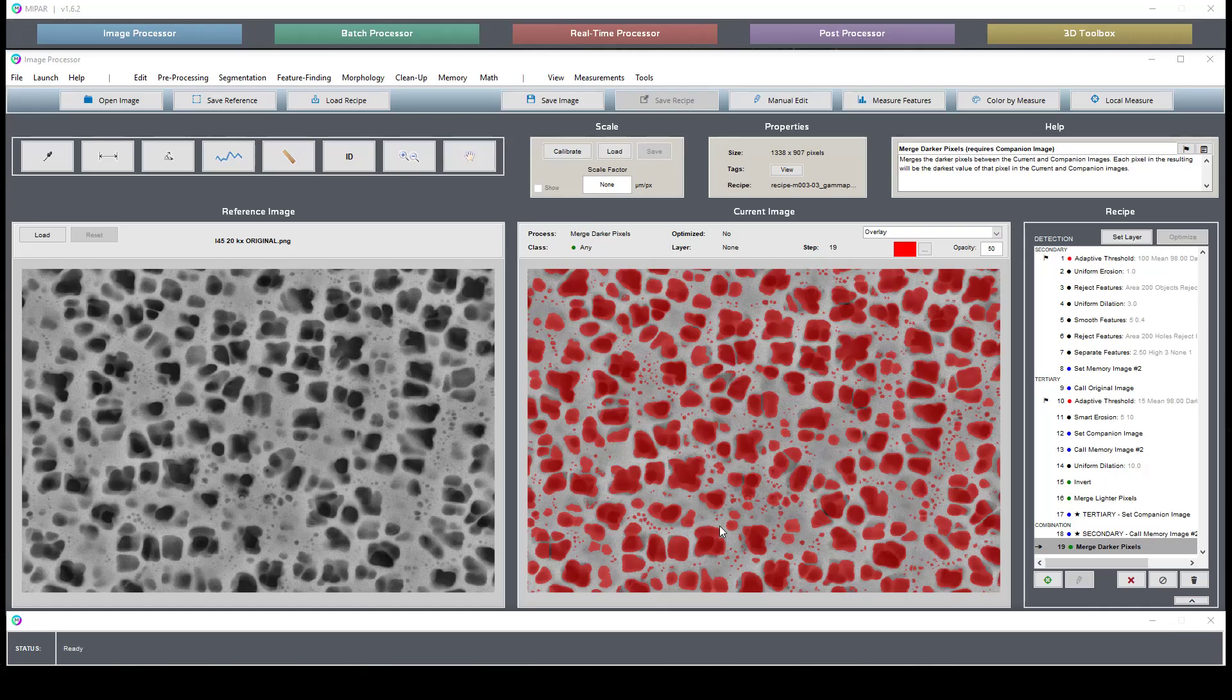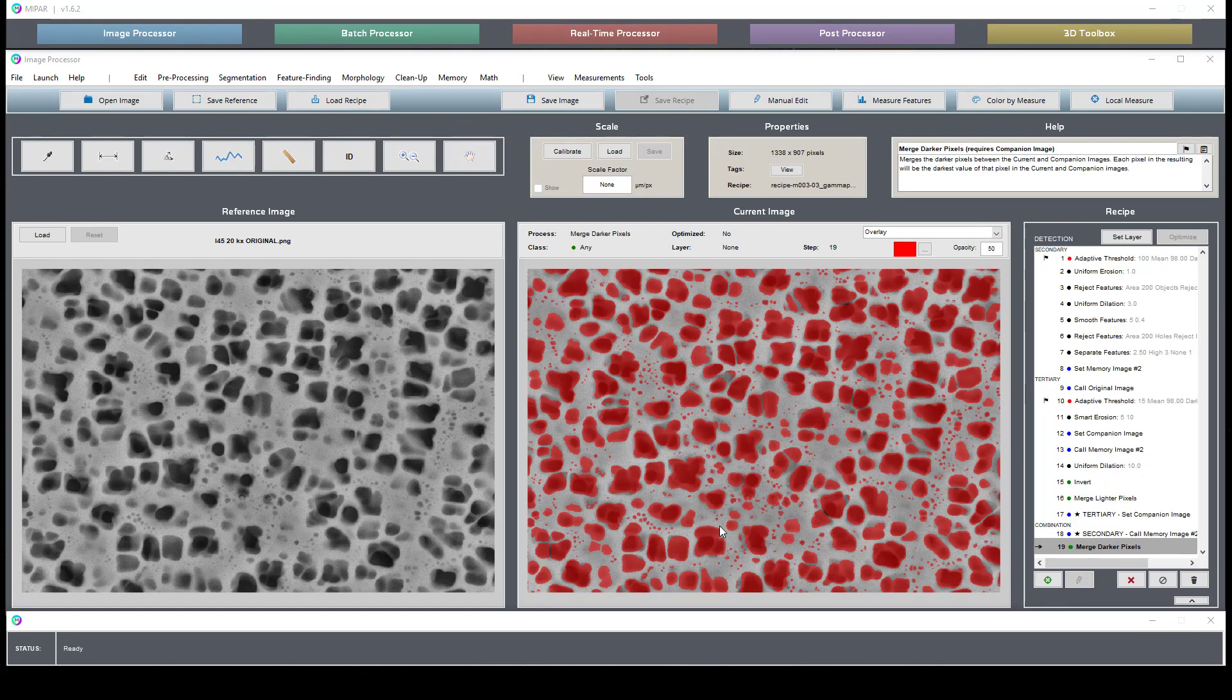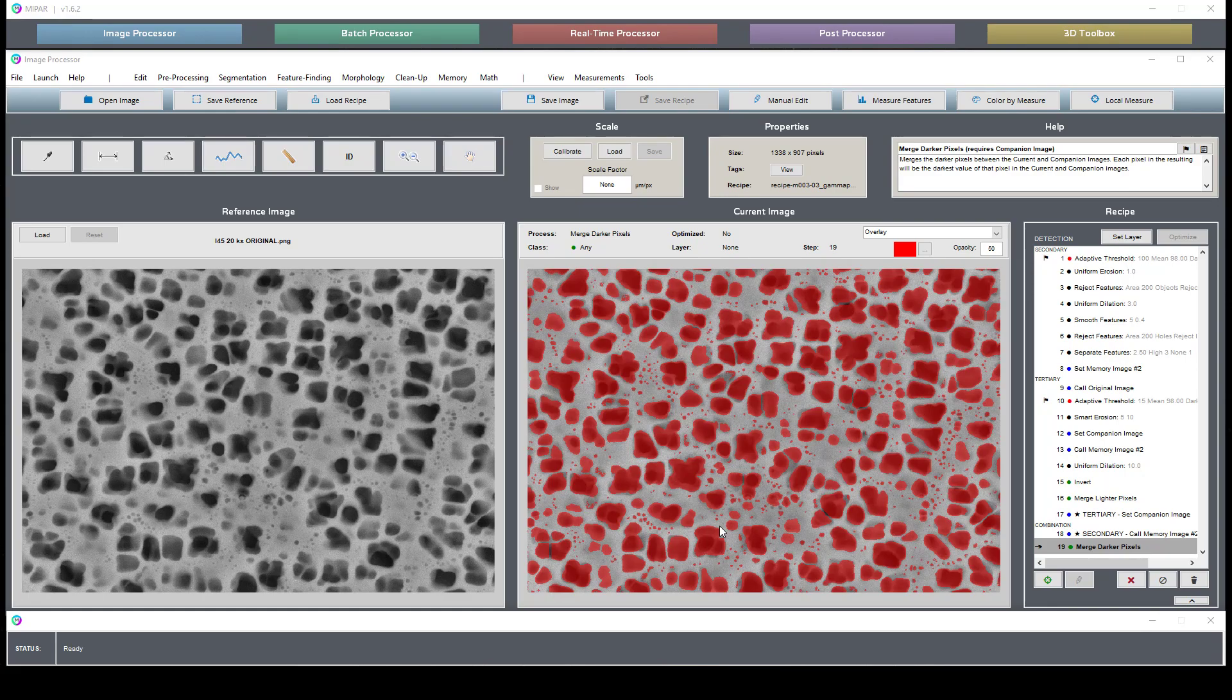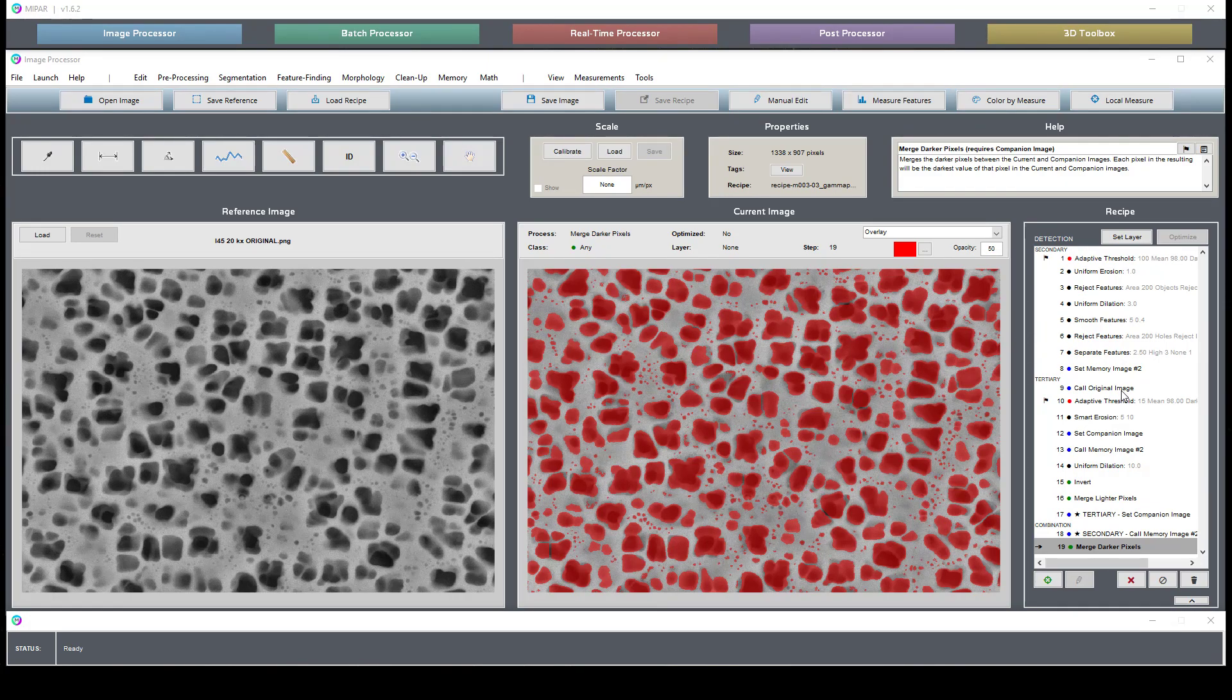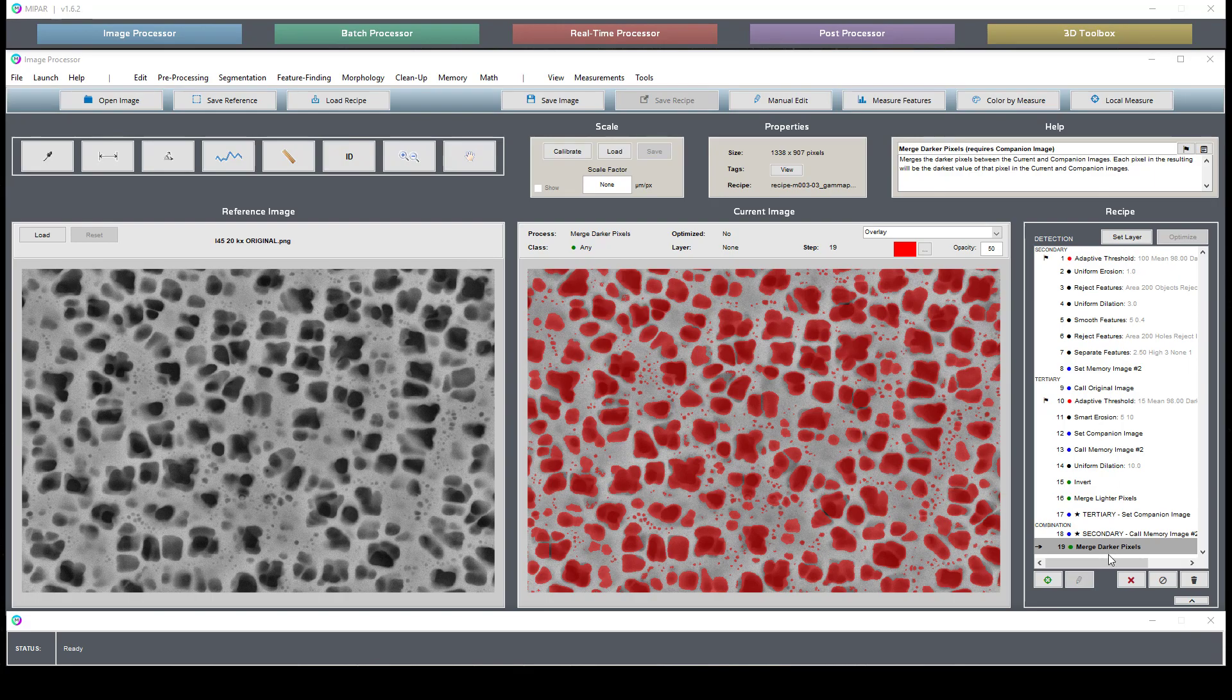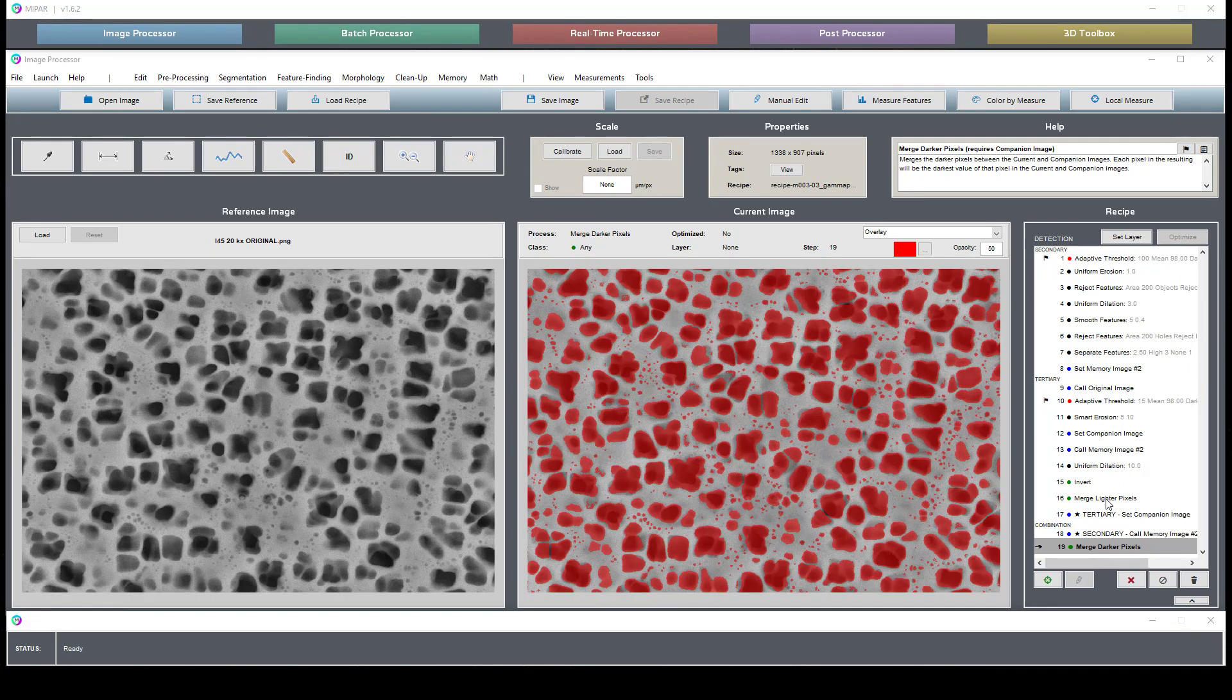We separate them based on size to help quantify this type of image. The recipe itself is broken down into three chapters labeled secondary, tertiary, and combination.